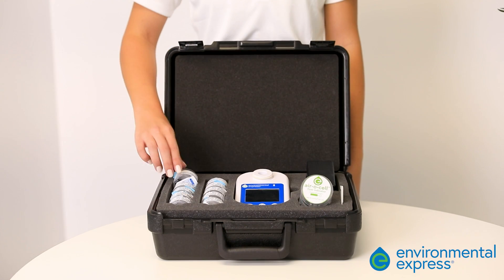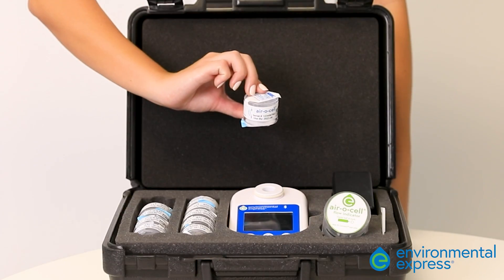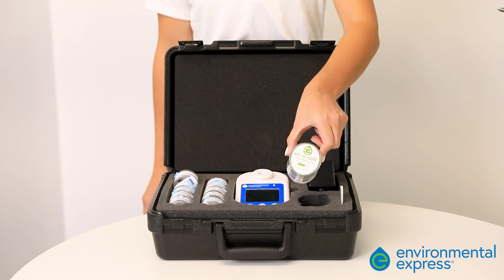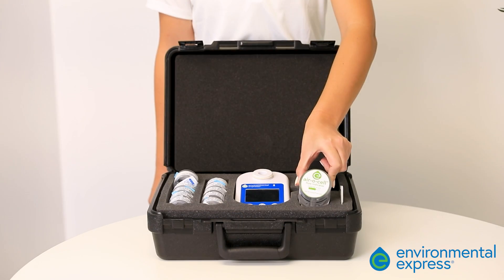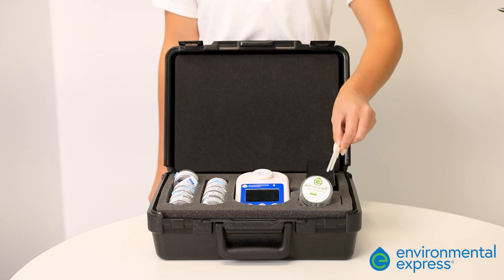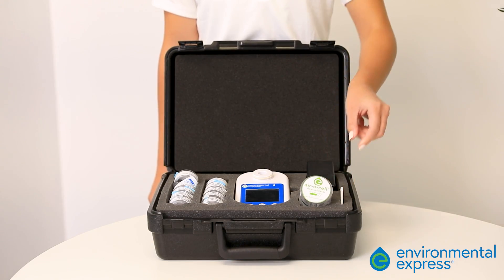You've just received your new IAQ15 Connect — now what? The IAQ15 Connect replaces our industry-leading bio-pump. The kit includes 10 aerosol cassettes, the aerosol flow indicator, the battery replacement tool, and a charging cord.